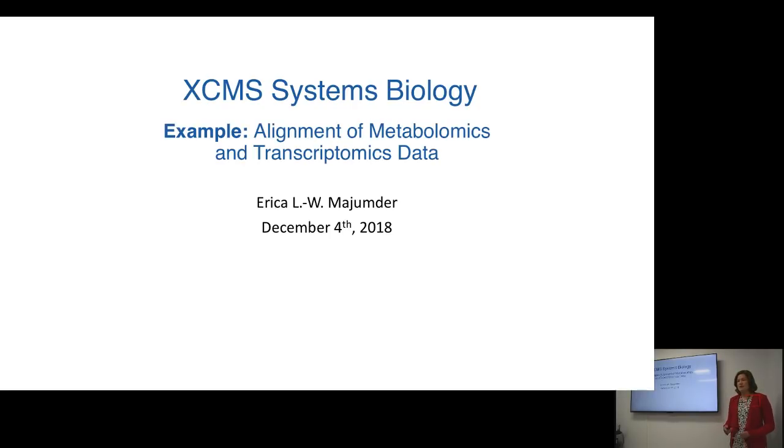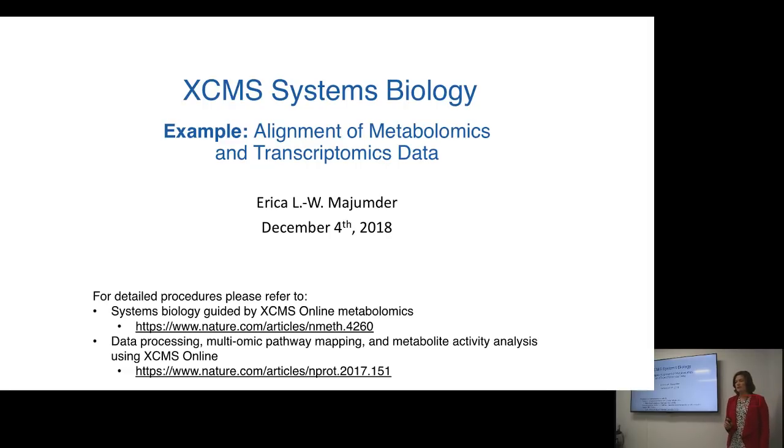I'll be giving an example of how we have aligned metabolomics data with transcriptomics data to get at real mechanistic understanding of our particular condition. If you need more detailed procedures of our experiments today, there are 2 papers out of our lab last year, one in Nature Methods that describes the systems biology portal in general, and then another one in Nature Protocols that will walk you step by step through how to use the platform in greater detail than I will demonstrate today, but also feel free to ask any questions.